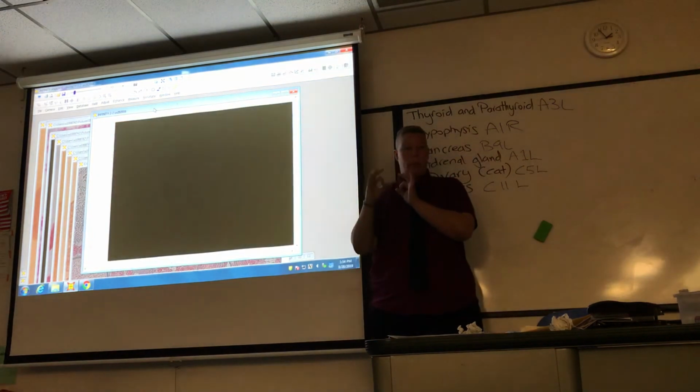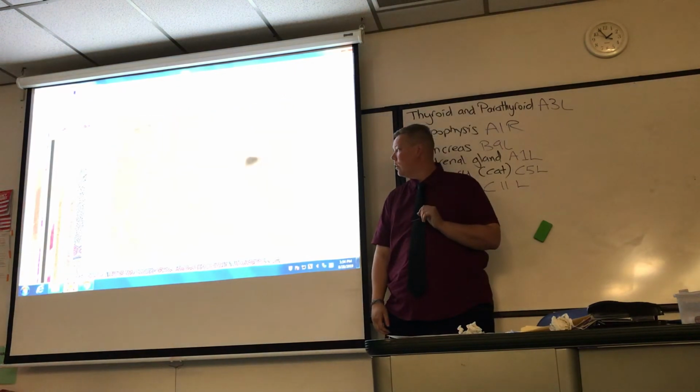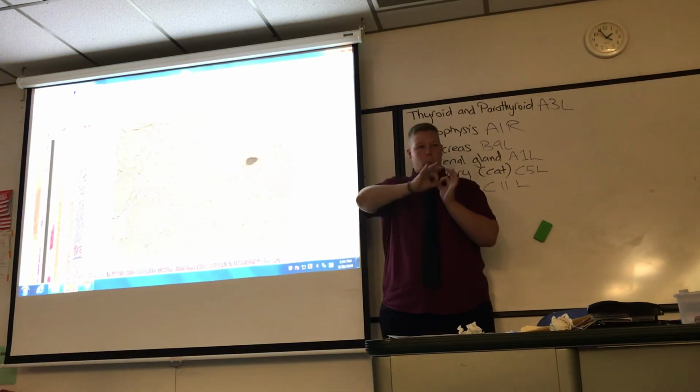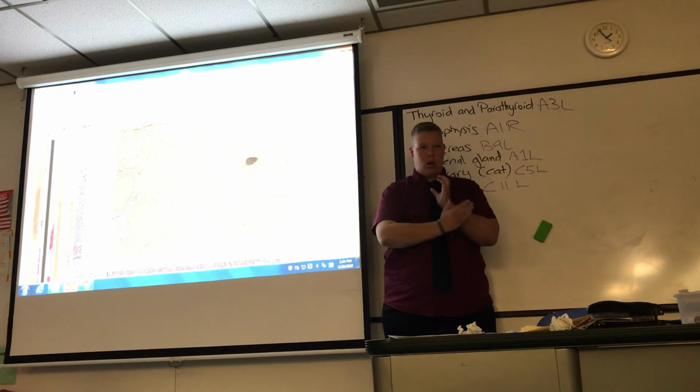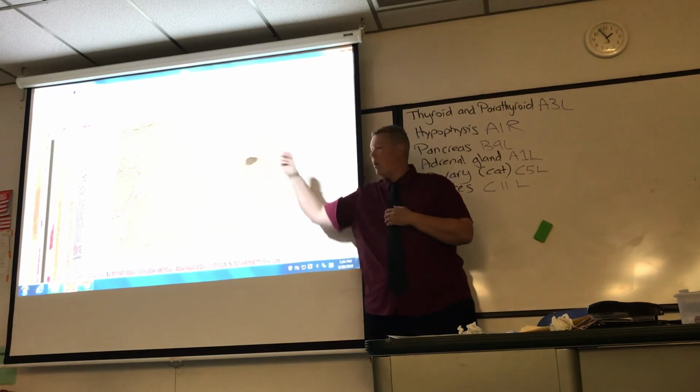Let me go closer up. That was low, this is medium. The way they stain these slides, the red blood cells in blood vessels stain black. Do you see one? Okay, let me go high mag on that.